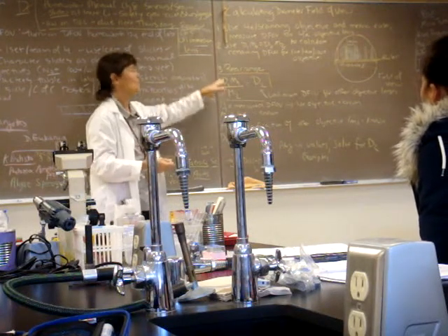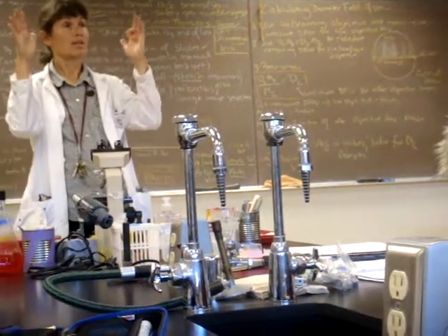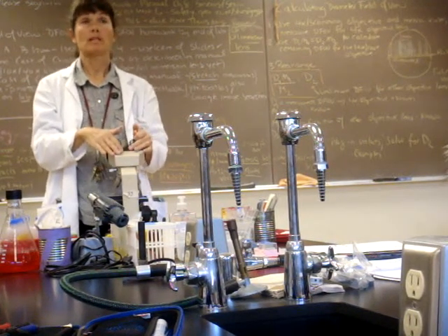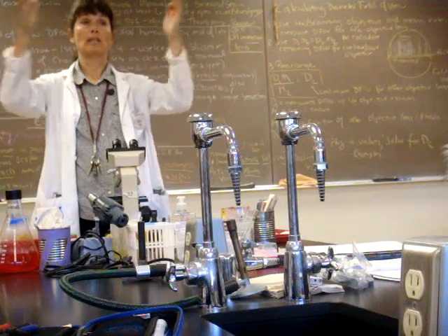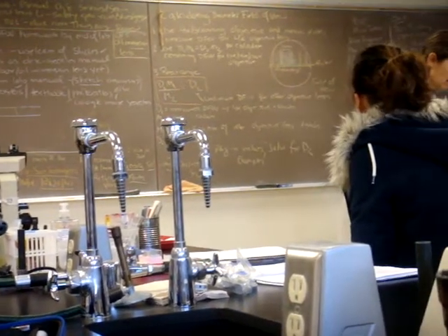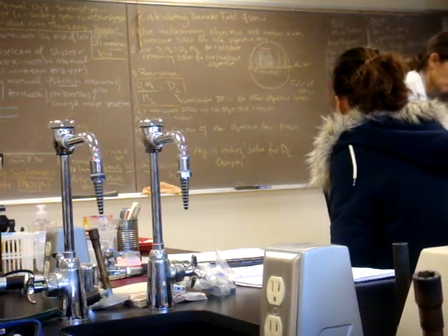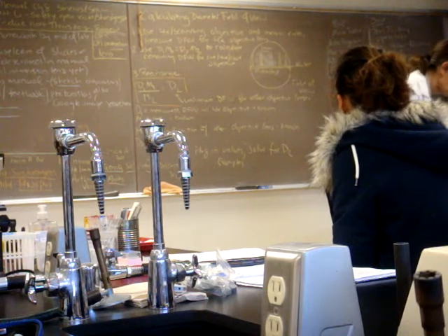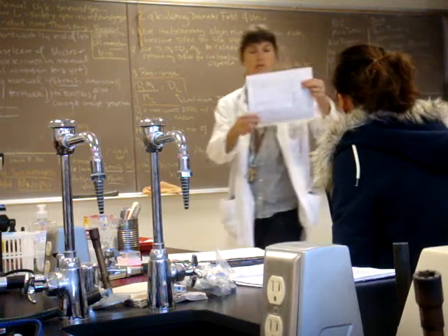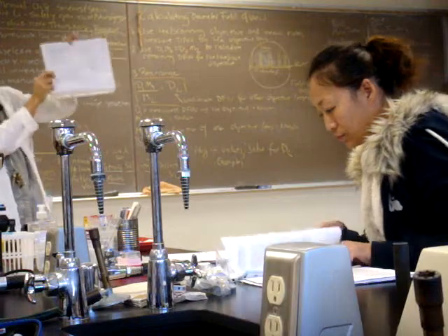Now, why do we have to use math? Well, the reason is, what happens to the diameter of the field of view as the magnifying power of your objective lenses increases? Is it going to get bigger or smaller? Smaller, right? Now, some of you may have seen under the shared lab resources in D2L, I made this little table that describes characteristics of your four different objective lenses.